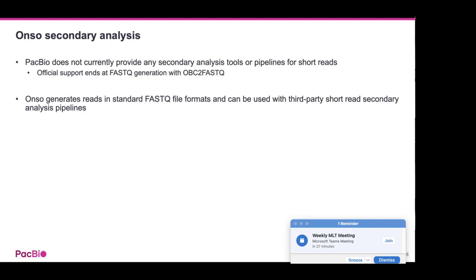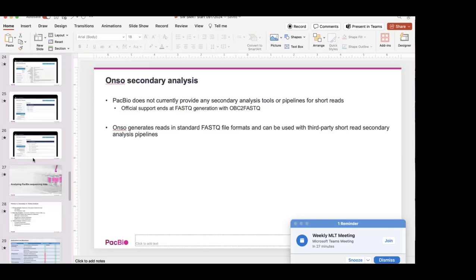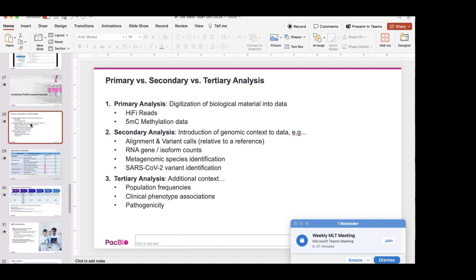So the question was, what was the purpose of the secondary analysis phase? The answer was, it is for applications like resequencing and will automatically do an alignment with the sequence you are comparing your sequence to.